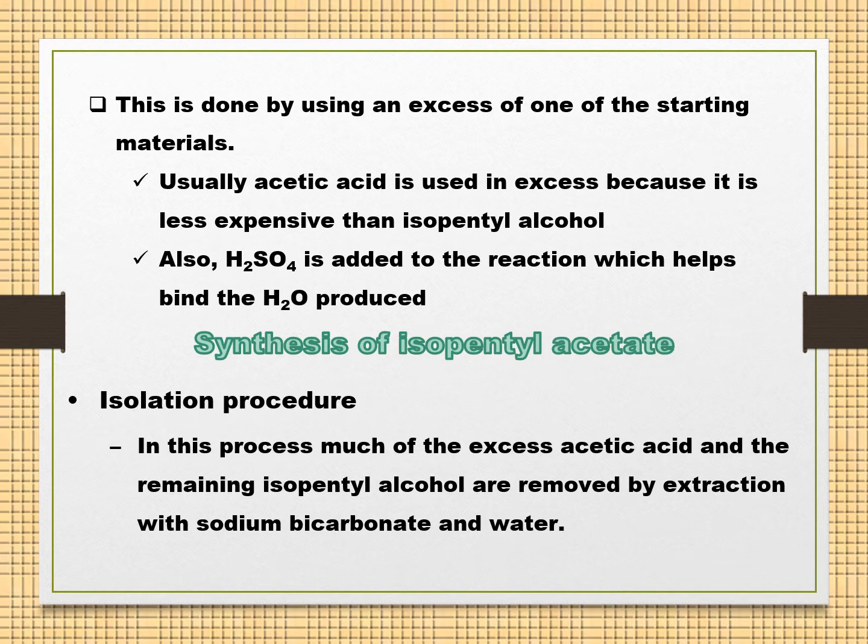In this case, we have the acid and the alcohol, but because we have the opportunity to add both, we can think smartly and choose to add the acid instead of the alcohol. Why? Because the acid is less expensive compared to the alcohol.